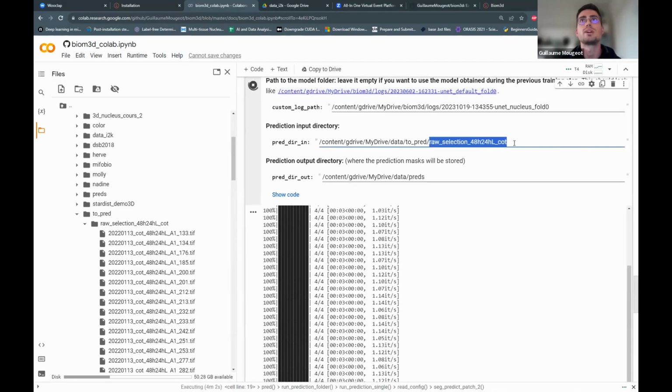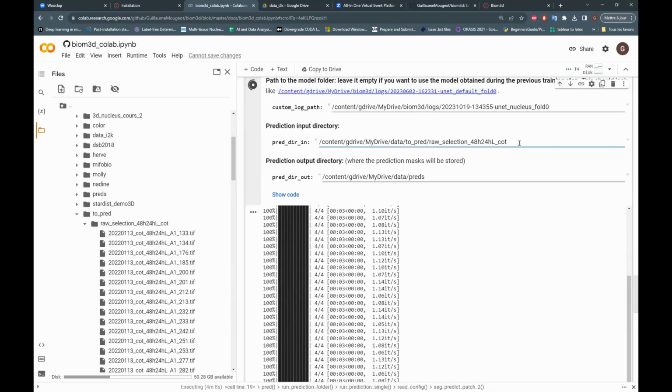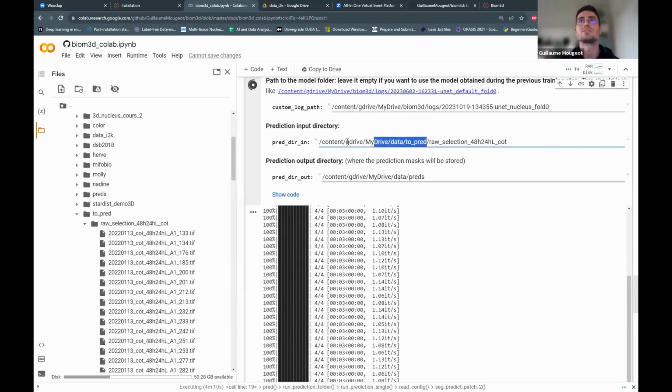You did not pass this row selection folder. Yeah, I think you passed just this folder. Got it.